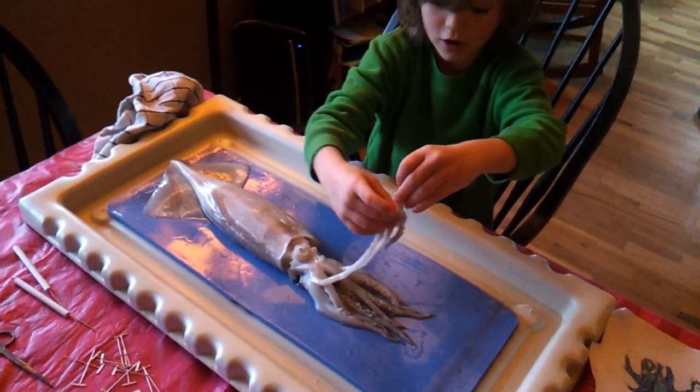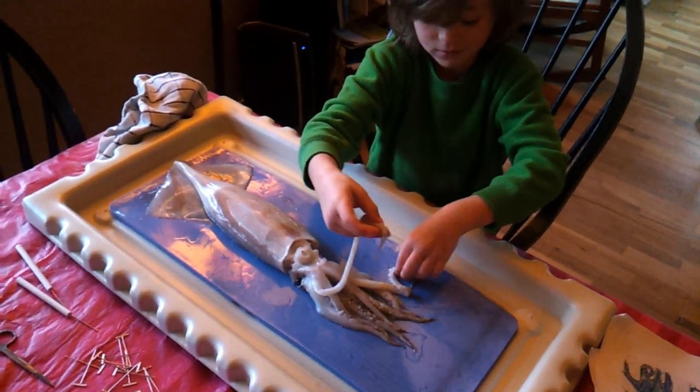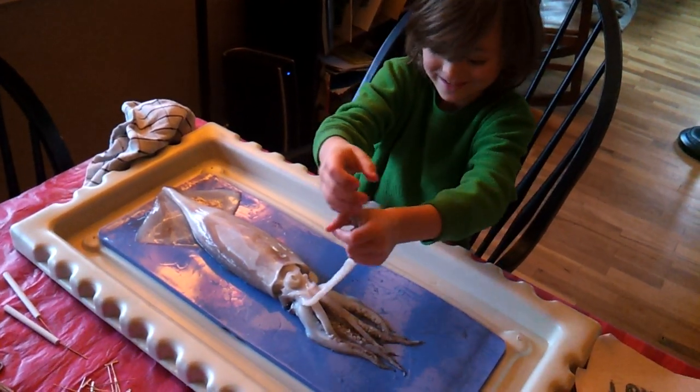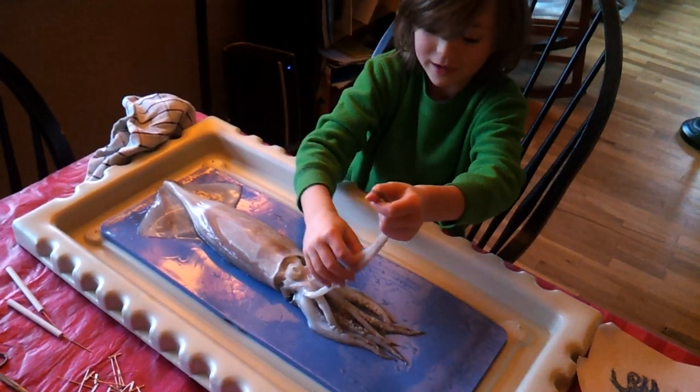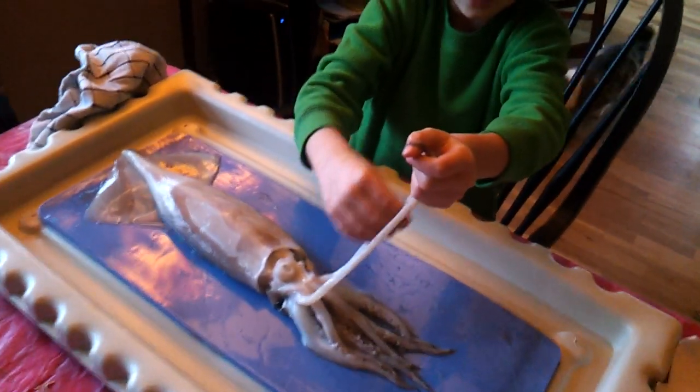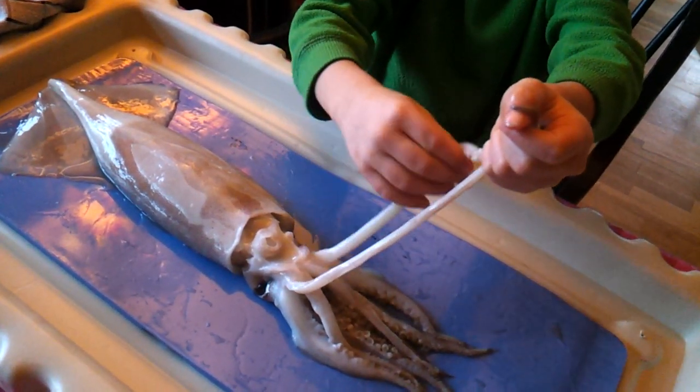All of those are tentacles? No, just these two. It just has two tentacles? Yes. How are those different than the other ones? Because look at these parts — these don't have tentacles all the way. Well, that is a tentacle.